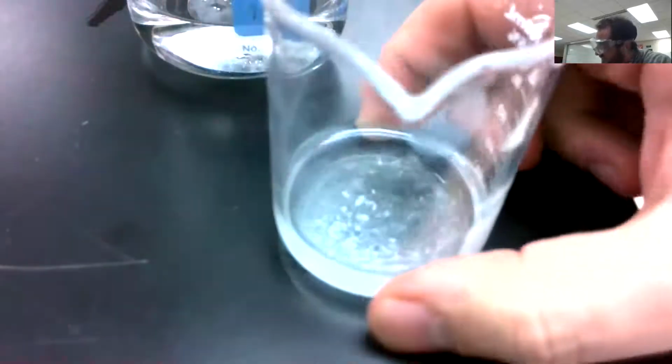And look at that solid. You guys can see those white particles in there. Those are solid. We call those in chemistry precipitate. That's a white precipitate. Again, you need to balance the chemical equation. You need to use your solubility tables. You need to figure out what that white precipitate is. Which of our 2 products is solid? It's not dissolvable in water. We can see it right there. It didn't dissolve in water. We mixed our 2 aqueous solutions, and we got a solid product.